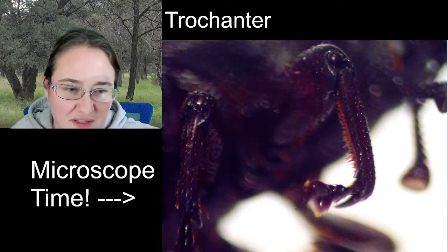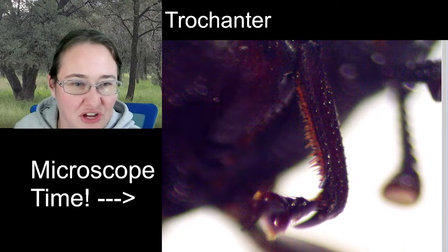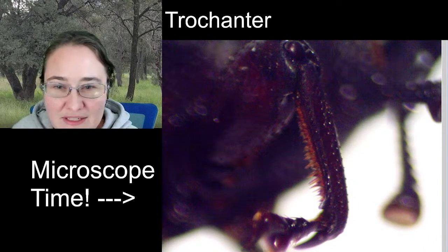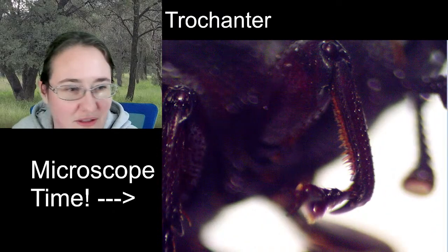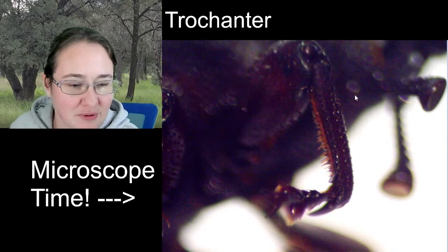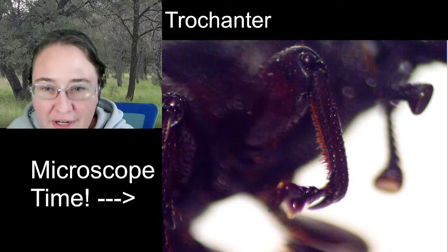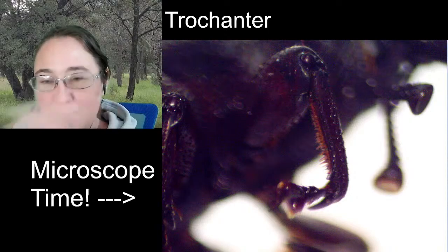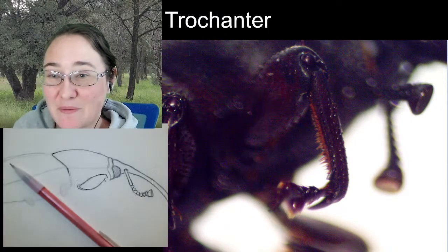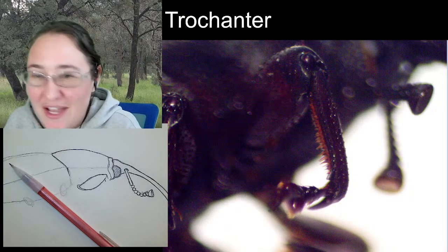Things that we can see on this microscope image. So up here where the, let's see, zoom out one. Alright, up there at the top. Why won't it go up? There. Up there at the top where the tibia connects to the femur, it almost looks like a ball and socket, which is kind of fun. Let me go ahead and write these words for you.